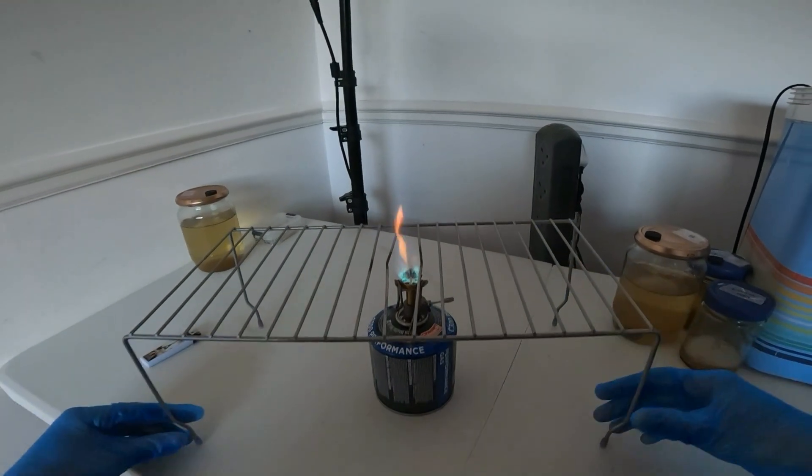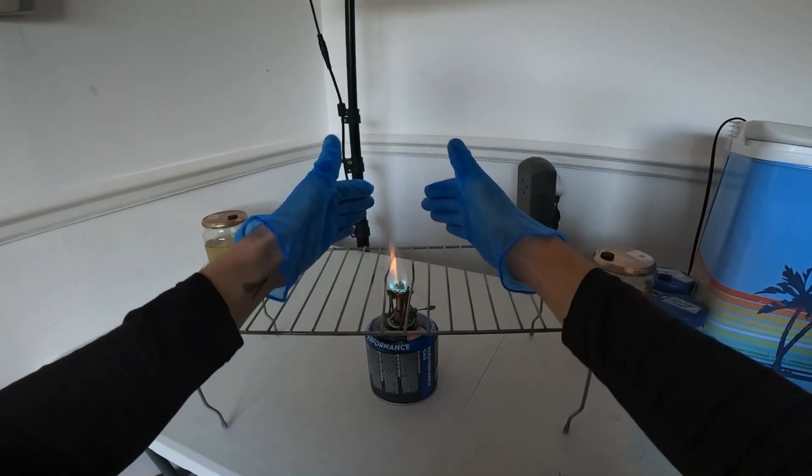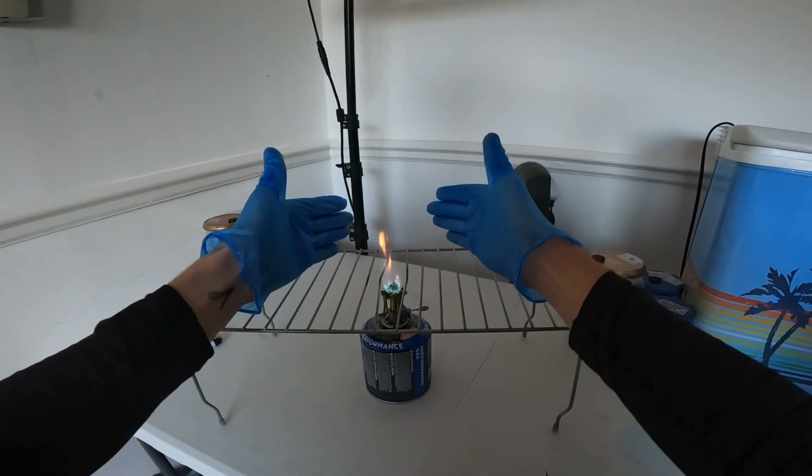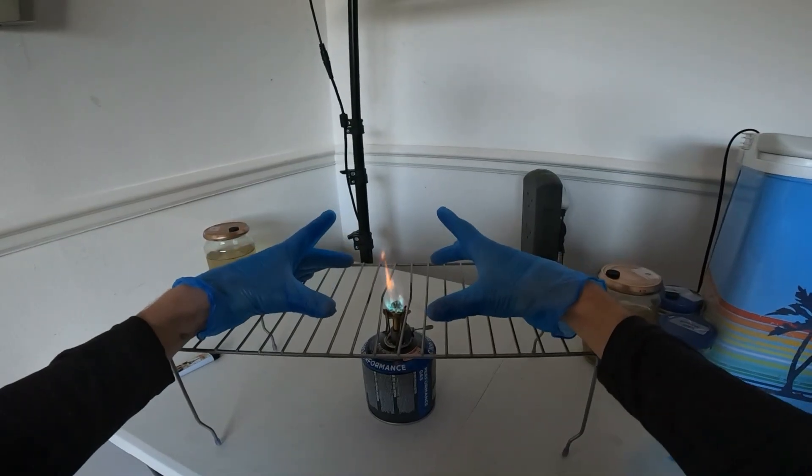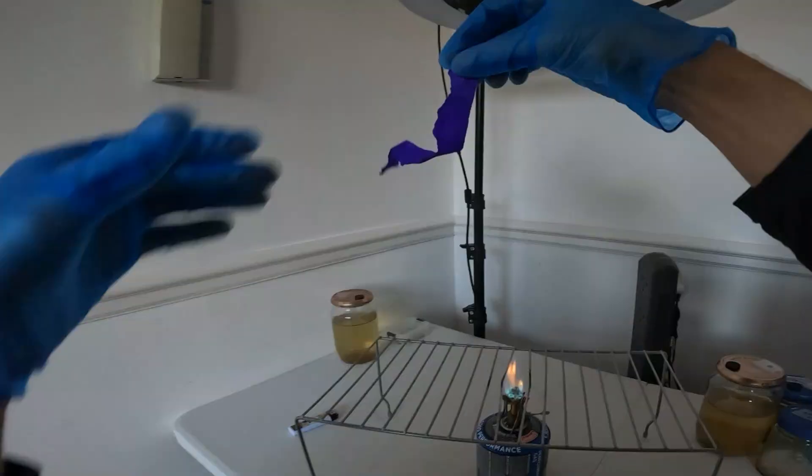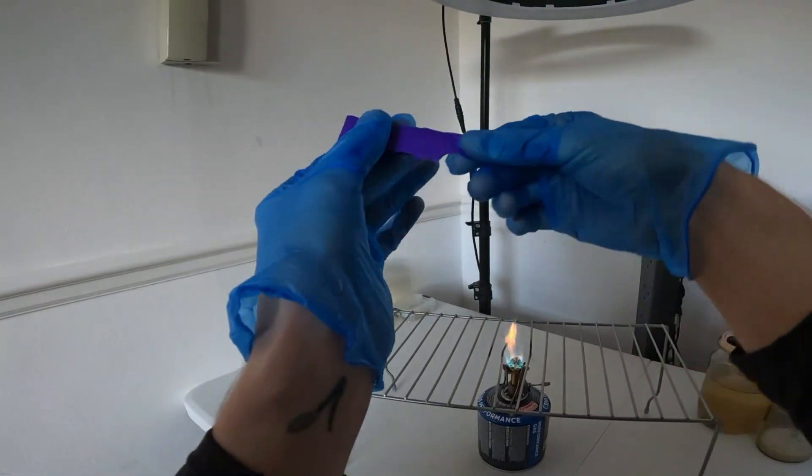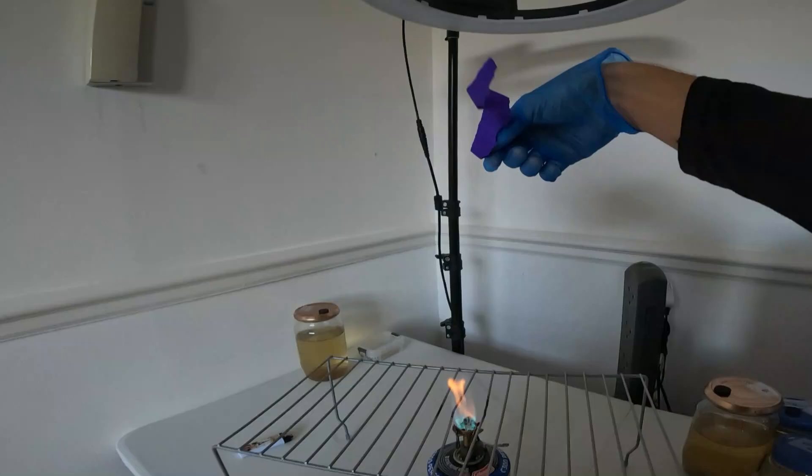I also wanted to give you this real life visualization of what I was just explaining. Here I can feel where the heat is, so this gives me a rough idea of how big my safe working zone is. And here you can see, just using this piece of paper, that the hot rising air is enough to make it rise up.